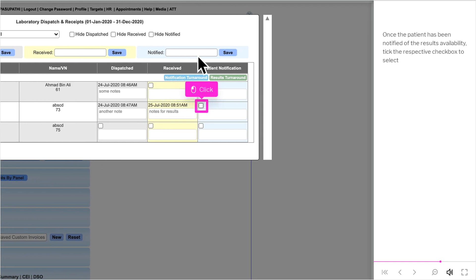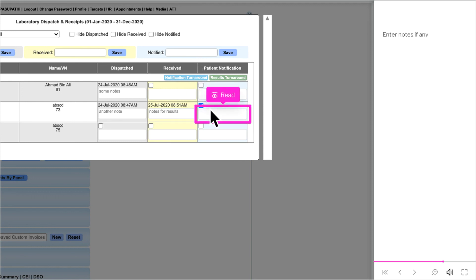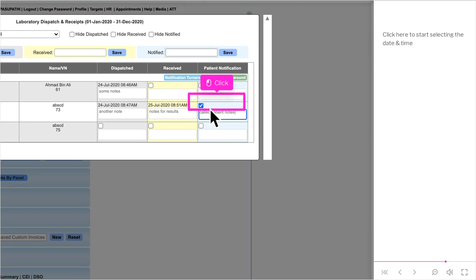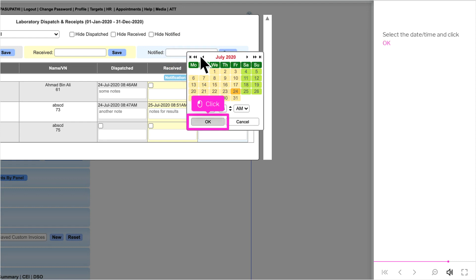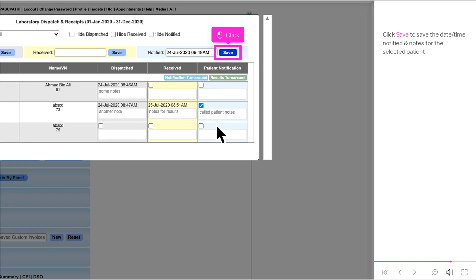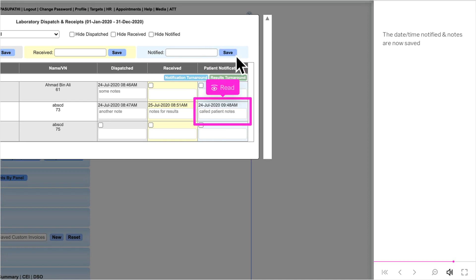Once the patient has been notified of the results availability, tick the respective checkbox to select and enter notes if any. Click here to start selecting the date and time, select it, and click OK. Click Save to save the date, time notified, and notes for the selected patient. The date, time notified, and notes are now saved.